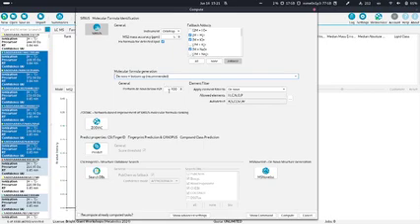For these features, we will always perform de novo molecular formula generation, but for the larger ones, there will only be bottom-up molecular formula generation performed. We will also do the bottom-up generation for compounds below this threshold, because what the de novo search does is that we have specific elements which are enabled. You can change these here on the right side.